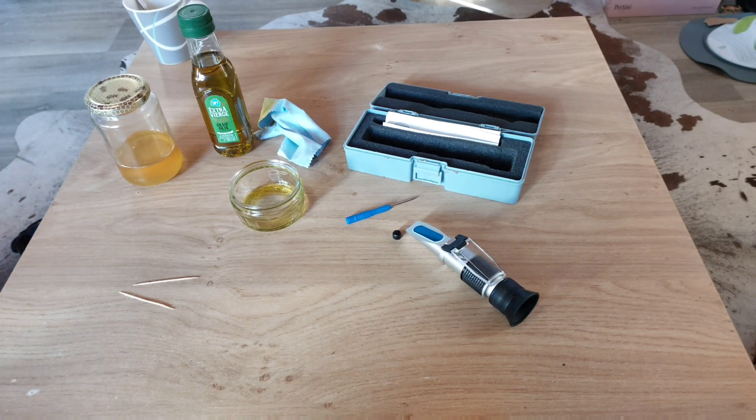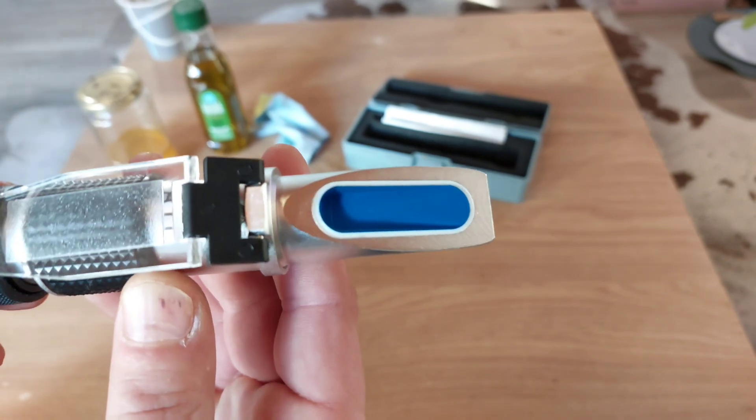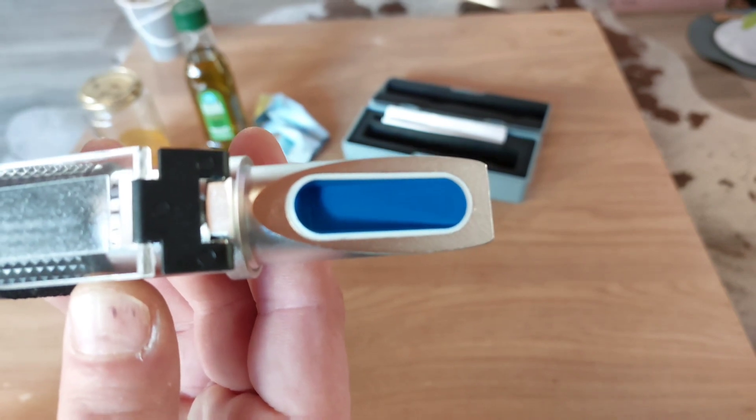Refractometer: calibration hack and use. What is a refractometer? A refractometer is a device to measure the amount of moisture in your honey.